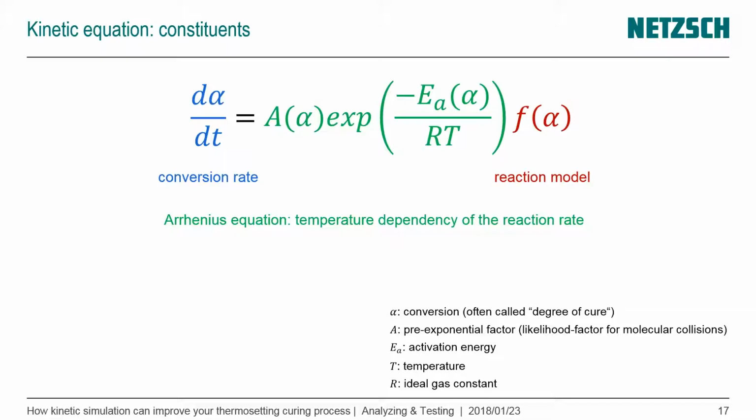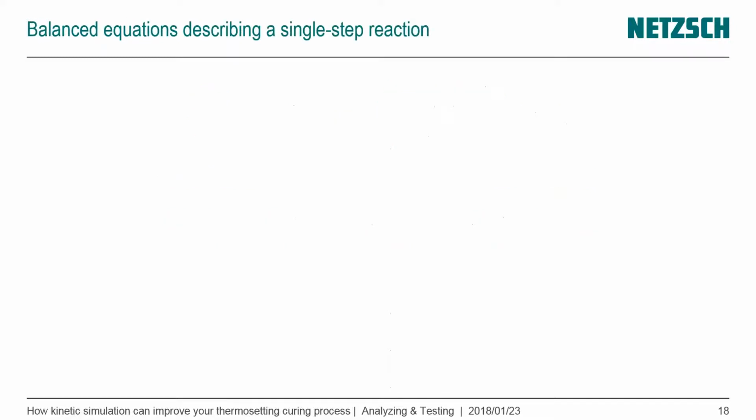And we have different parameters in there, but don't worry about them. We don't have to deal with that. So I will show you the use of Kinetics NEO and the benefit, and will not go too deep into the details. So if you're interested in it, please contact us. We can tell you about it, but I don't want to make you be afraid during this webinar today.